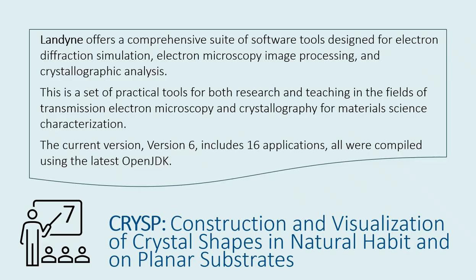We have created a series of videos for each software application, including one for the launcher. In this video, we'll introduce CRYSP construction and visualization of crystal shape in natural habit and on planar substrates.